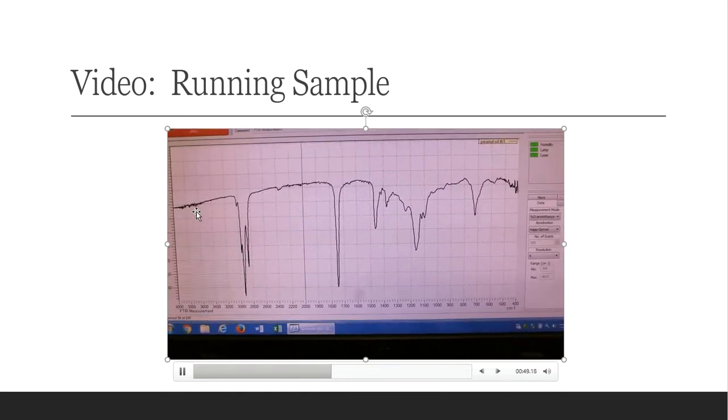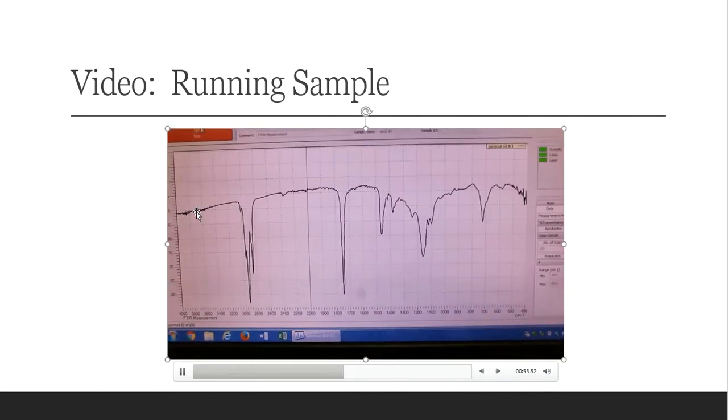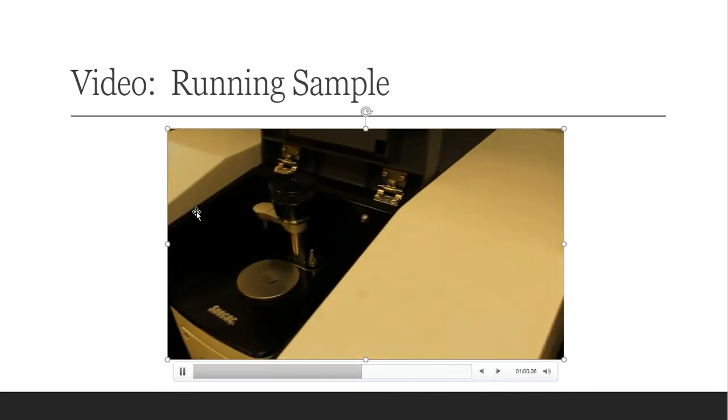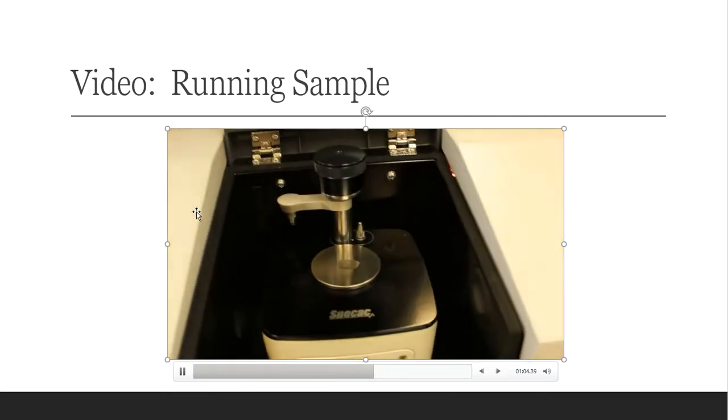The thing here is that peanut oil is very hard to distinguish from another type of oil because they have such similar characteristics. So if it comes up as an oil, I'll be very happy, and that's really all that I'm after. I'll do the same thing with the stock peanut oil as well.